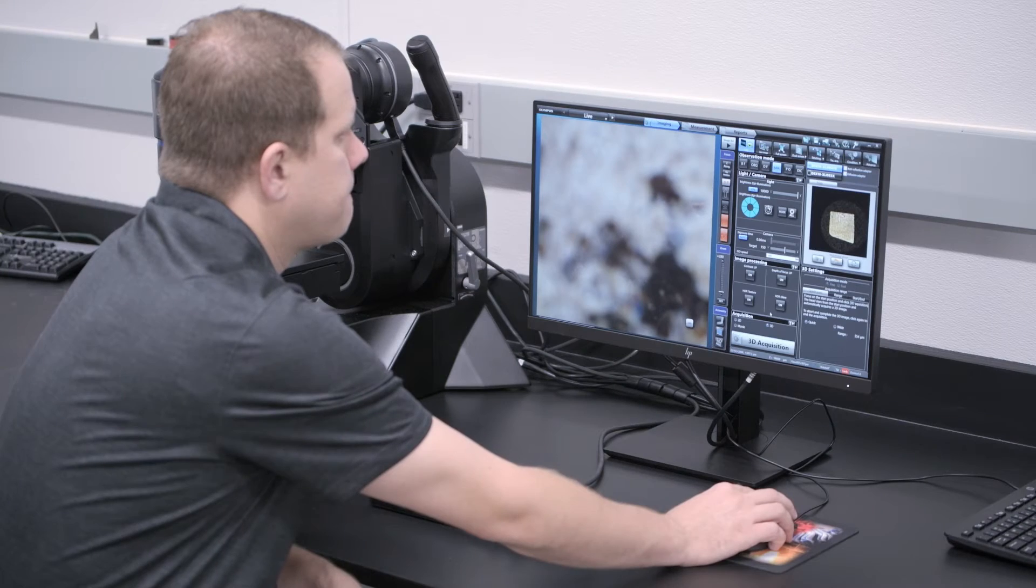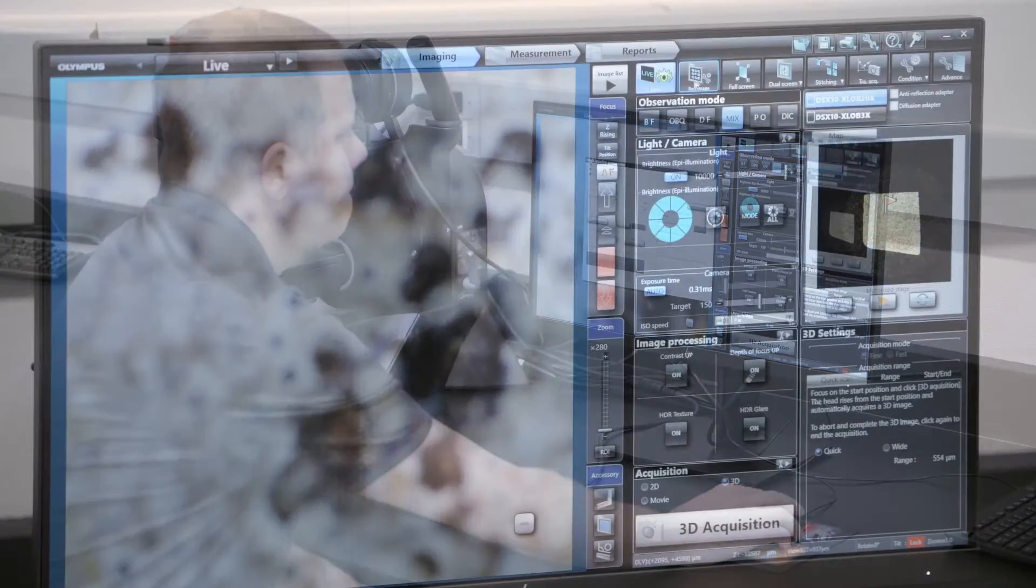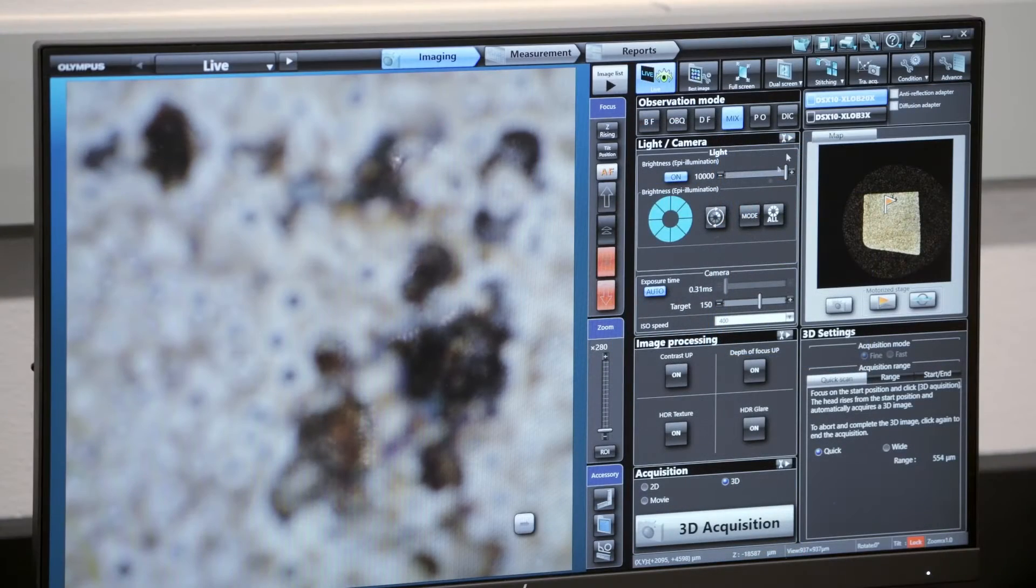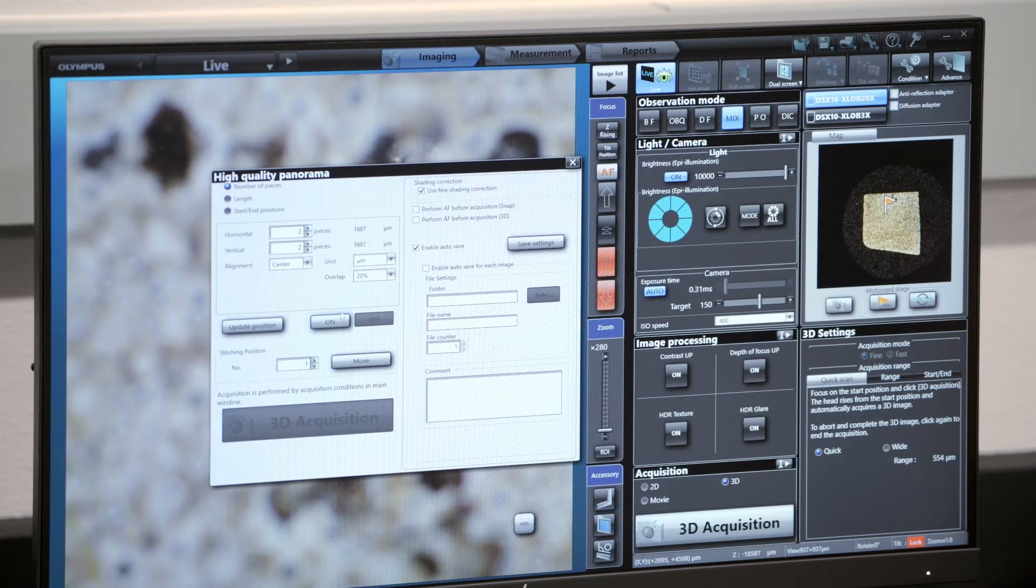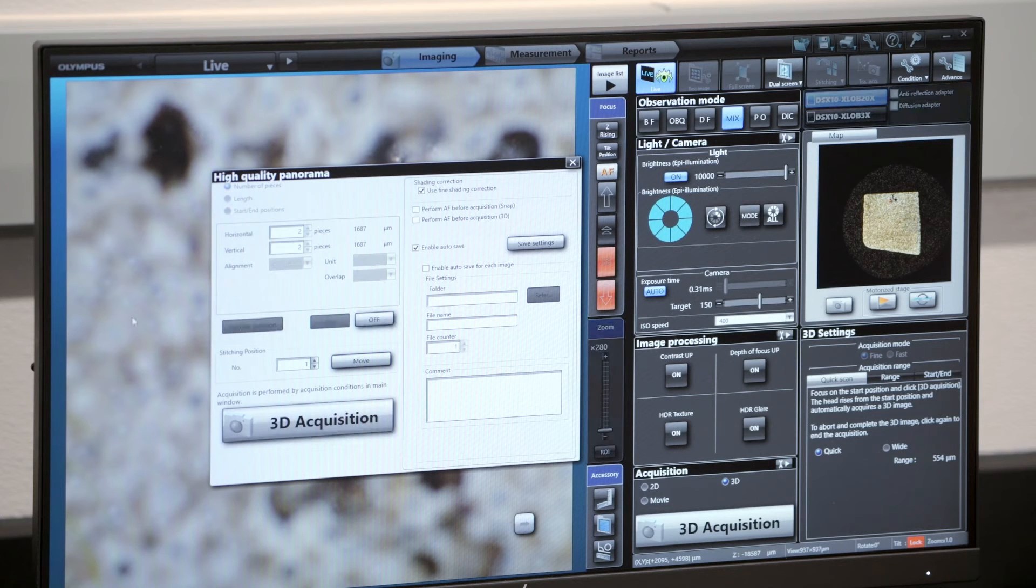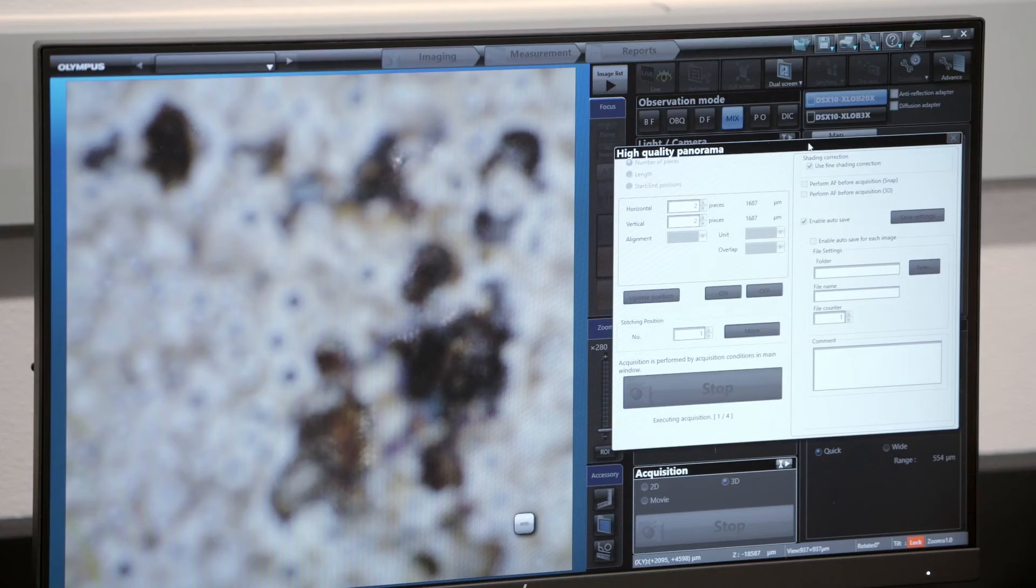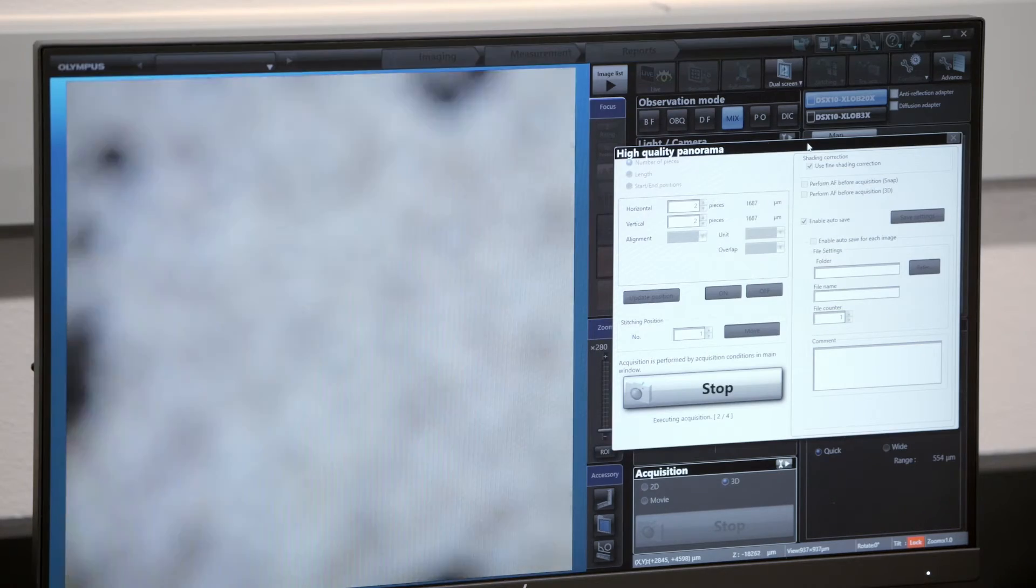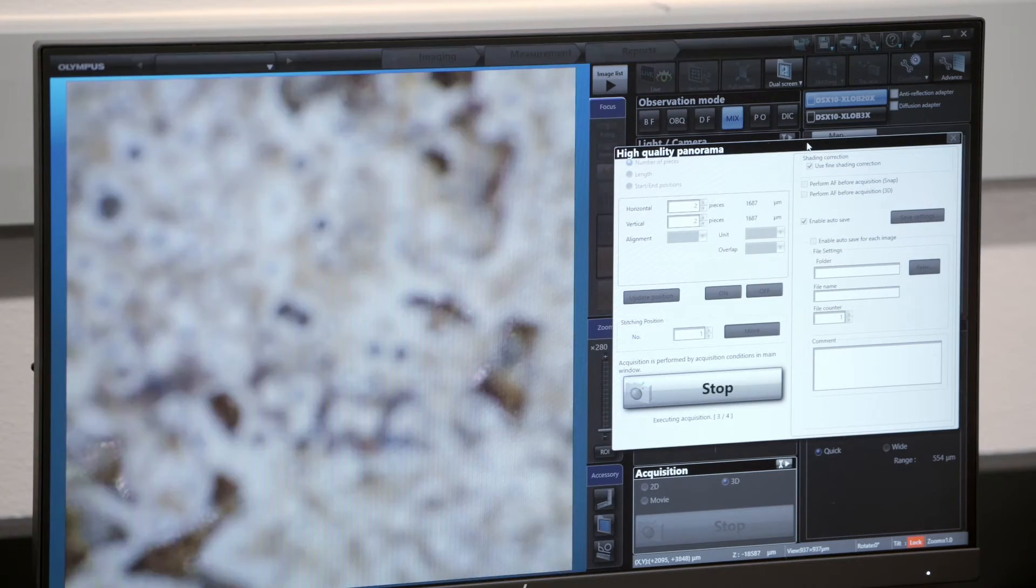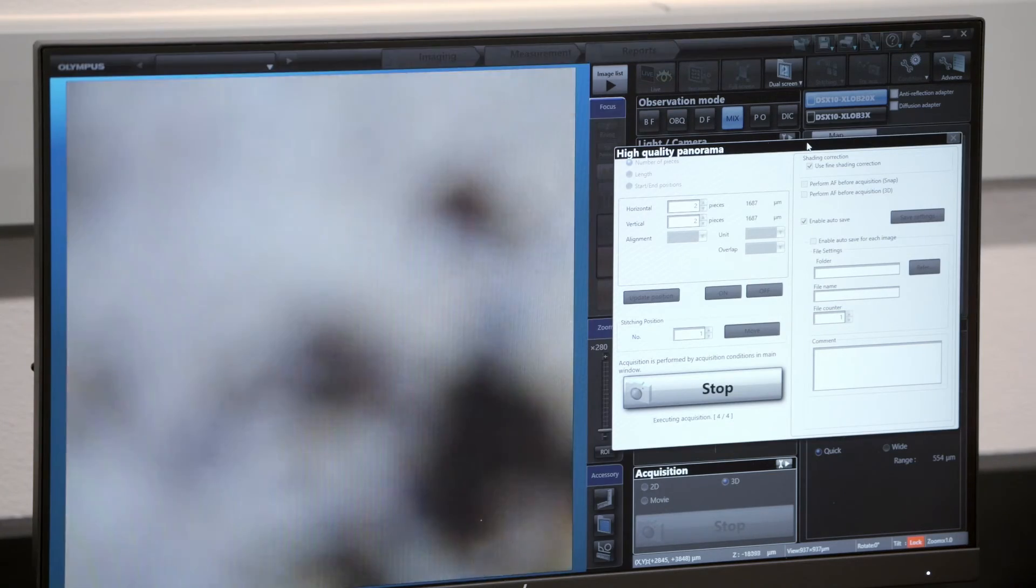The DSX-1000 features a high-resolution 60 frames per second digital microscope camera for rapid acquisition of 2D and 3D images. A stepper-driven stage accelerates acquisition of your images, large and small.